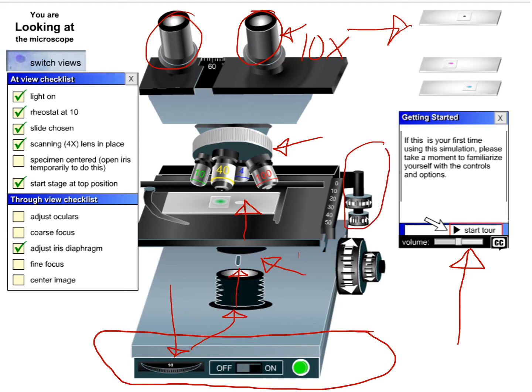Next, these two dials here move the stage left and right, forward and backward. These two are the coarse and fine adjustment for focus. The big one is the coarse adjustment, and you should only use the coarse adjustment when you're on the lower power magnifications. When you get up to the really high-powered ones, the lens is really close to the microscope, and if you use the coarse adjustment on high power, you can actually press the lens through the slide, breaking one or both of them. So on high power, you're going to want to use this small adjustment knob, which is called the fine focus, and it just moves the stage up and down a little bit.